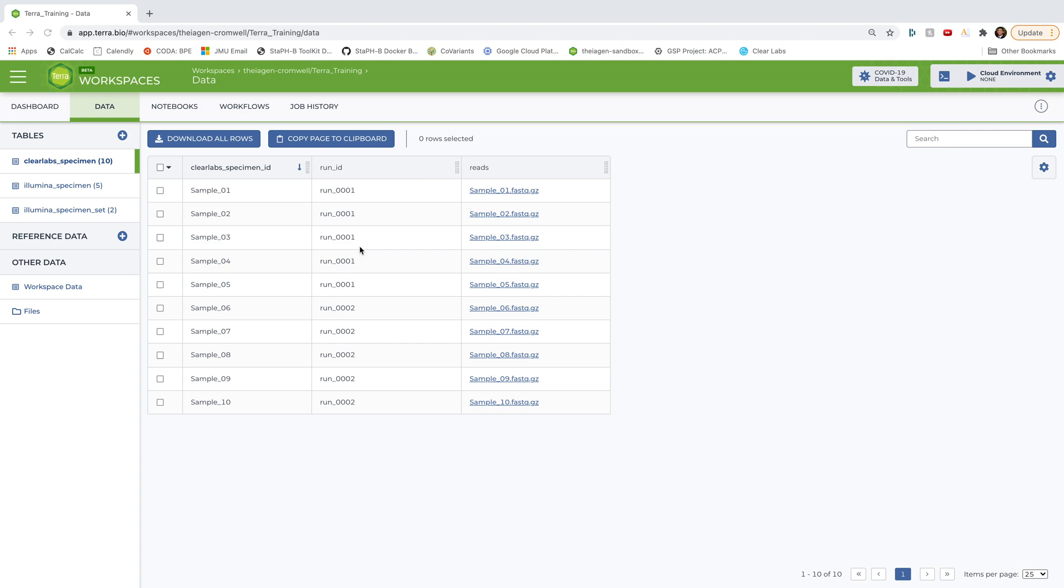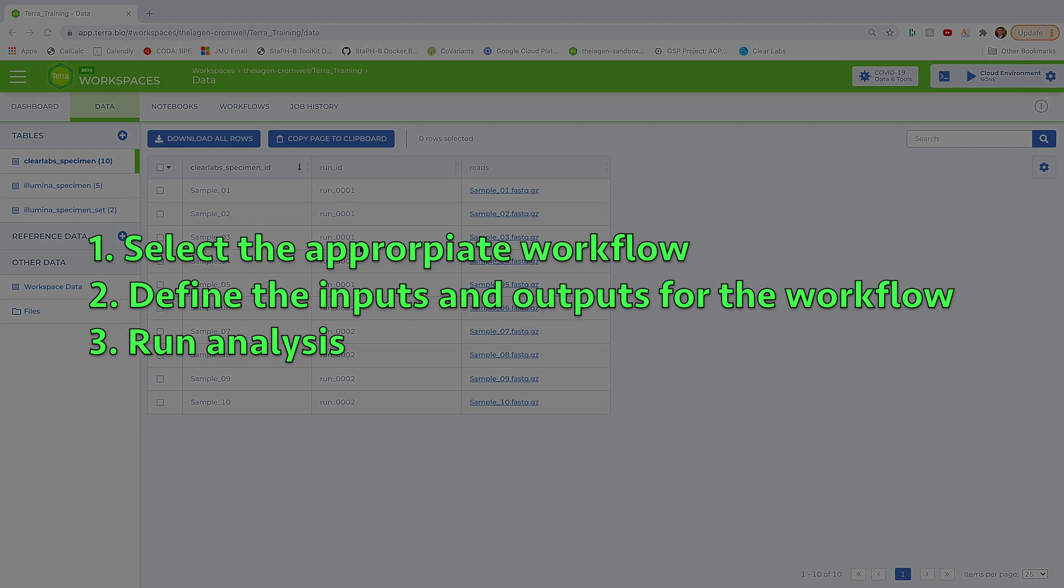Okay, so before we start, again, the basic steps for running any workflow in Terra are to 1. Select the appropriate workflow. In our case, Titan Clear Labs. 2. Define the workflow inputs and outputs. For us, it's run 0001 samples in the Clear Labs specimen table. And then 3. Running an analysis.